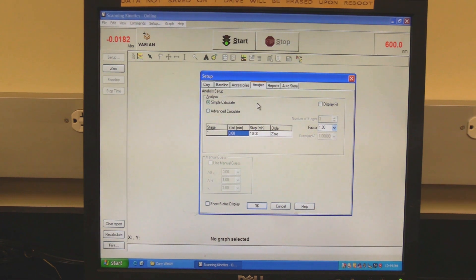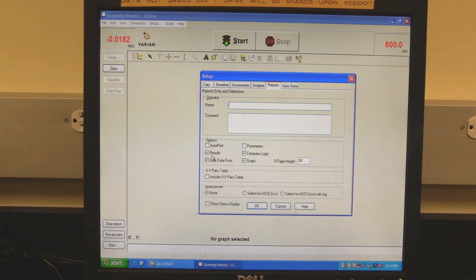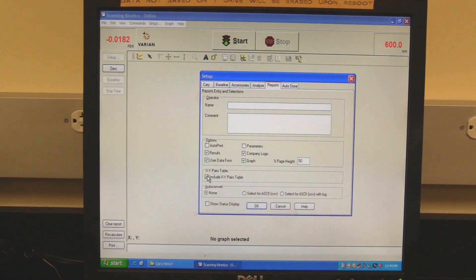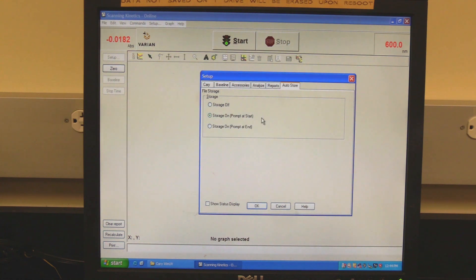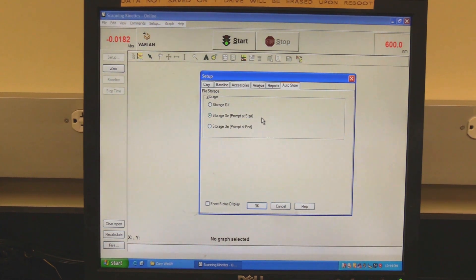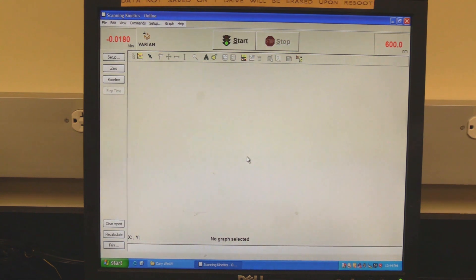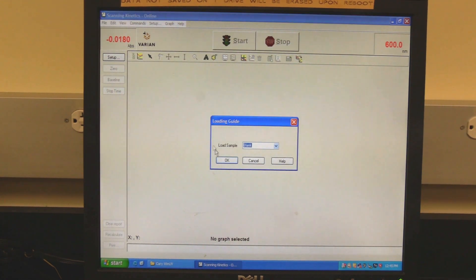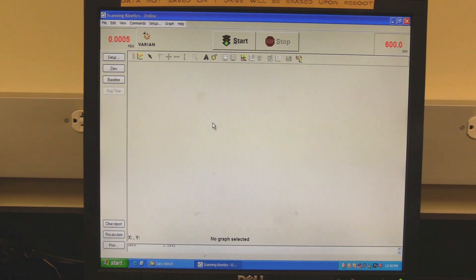Click on the report tab. In XY pairs, check the include XY pairs table box to include a table of XY values in the report. Click on the auto store tab. Select when the software should prompt for the data to be collected. Click OK to set the setup parameters. Click on the zero button. When prompted, click on OK. In some cases, the instrument may need to be zeroed twice.